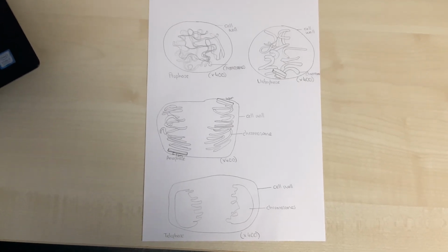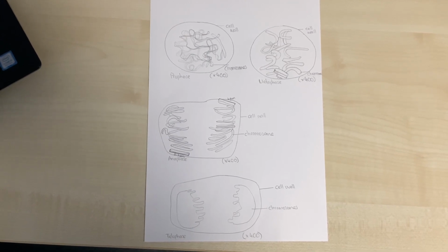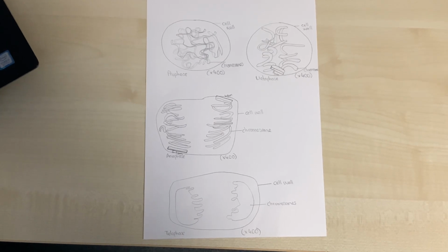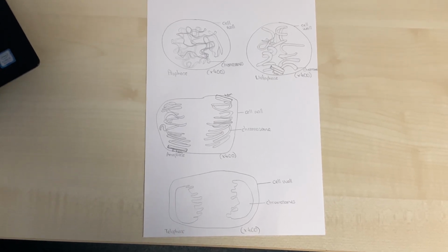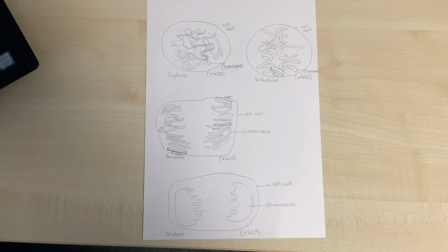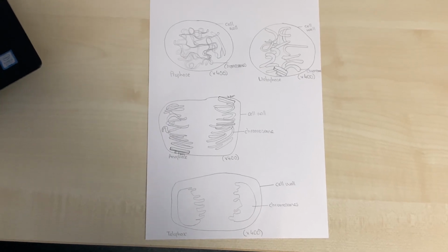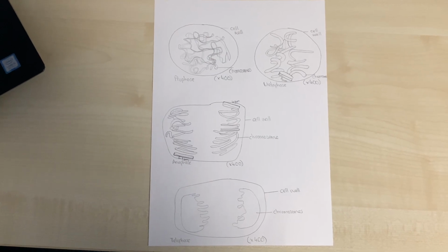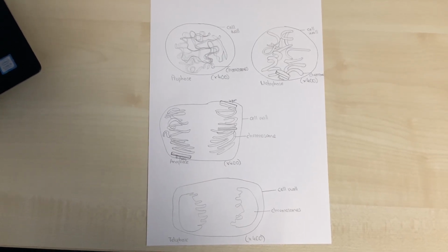You'll need to use the eyepiece graticule to measure the length of 3 different chromosomes. You need to do this carefully, but they don't have to be from the same stage. As you can see, I've labelled 1 in metaphase and 2 in anaphase. As long as you have 3 chromosomes measured and annotated onto your diagram, it doesn't matter which stage they come from.